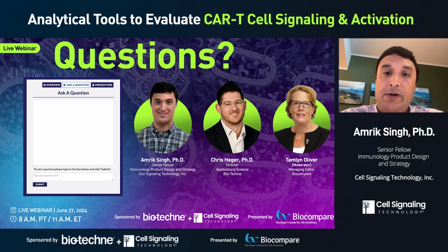So yes, we do have commercially available kits to enrich CAR T cells using bead-based sorting, and we routinely achieve greater than 90% purity with both of these kits that I just described.